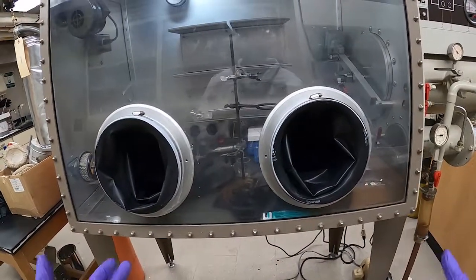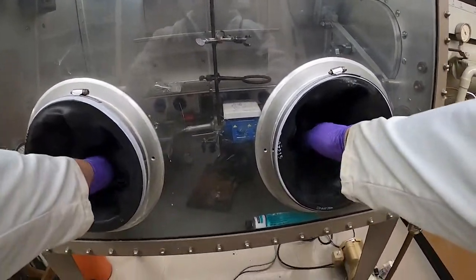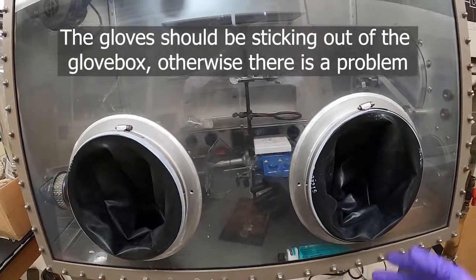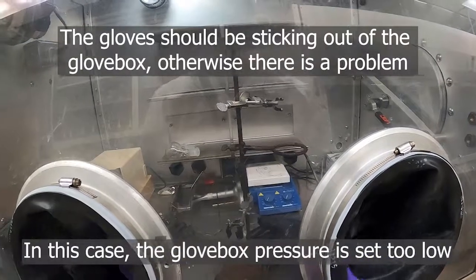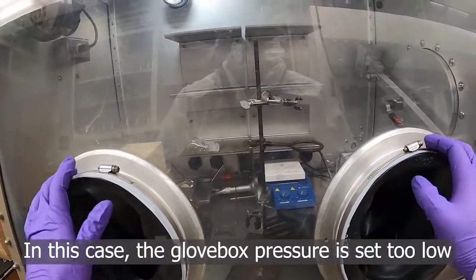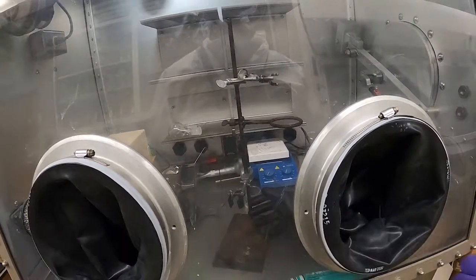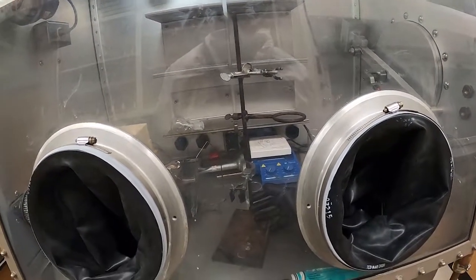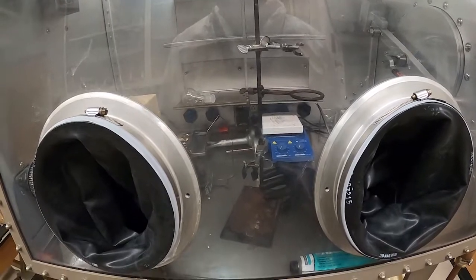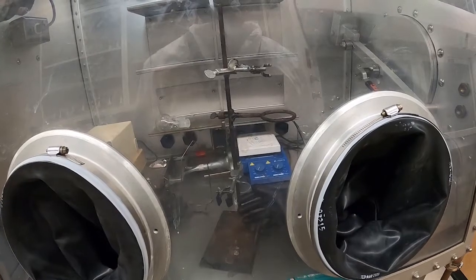For the gloves of the glovebox, normally you would want them to be sticking out of the glovebox. If they're not, that can indicate a problem. If the gloves aren't sticking out or are laying flat, that means you don't have enough positive pressure in your glovebox — you need to address that issue, because it can indicate that your glovebox has a leak and is not maintaining the atmosphere properly.